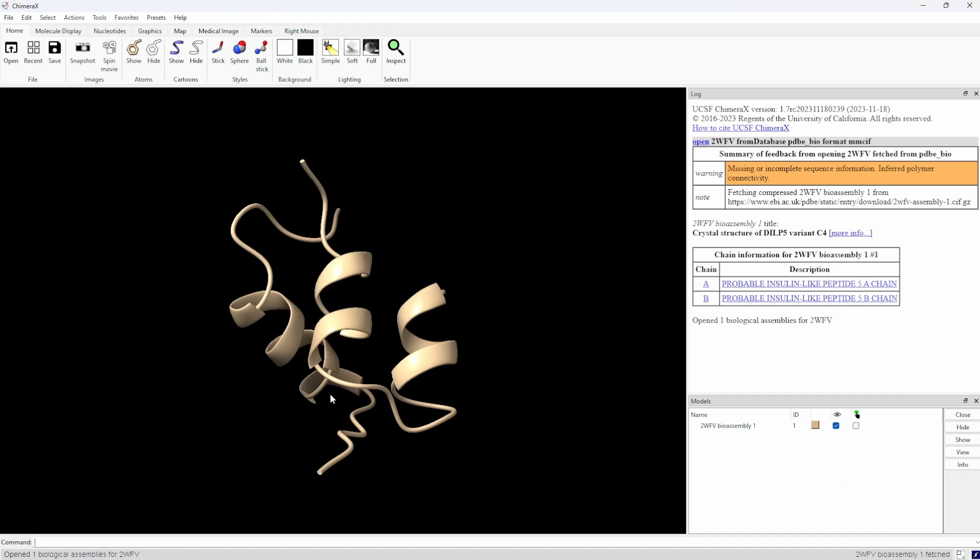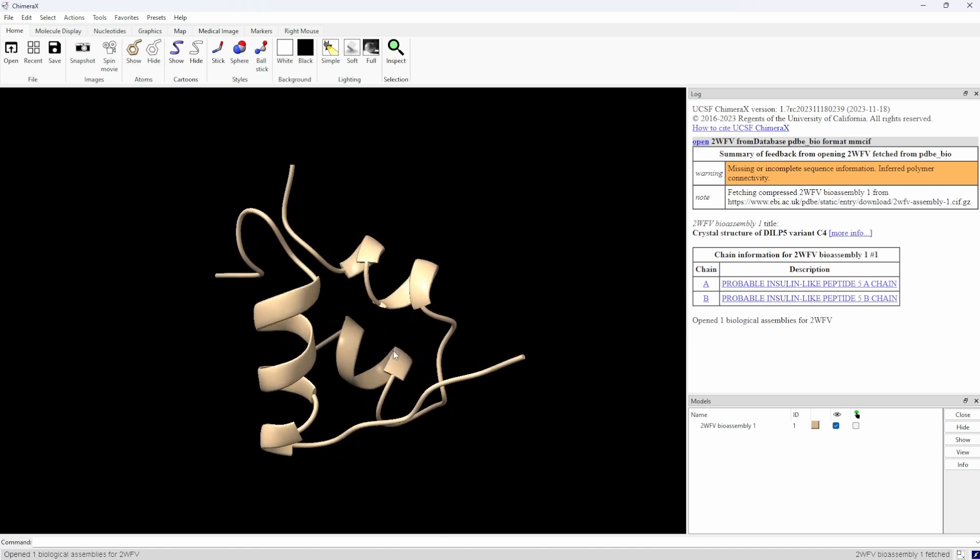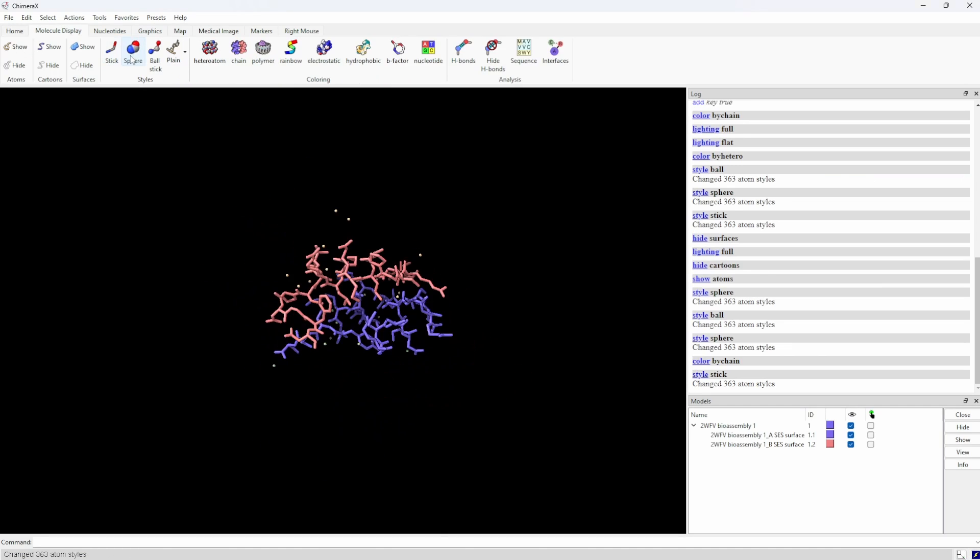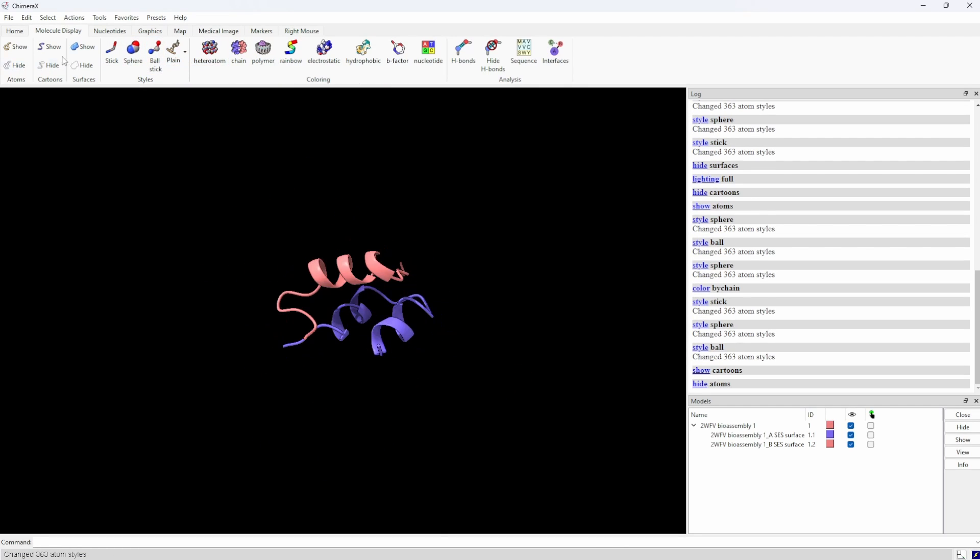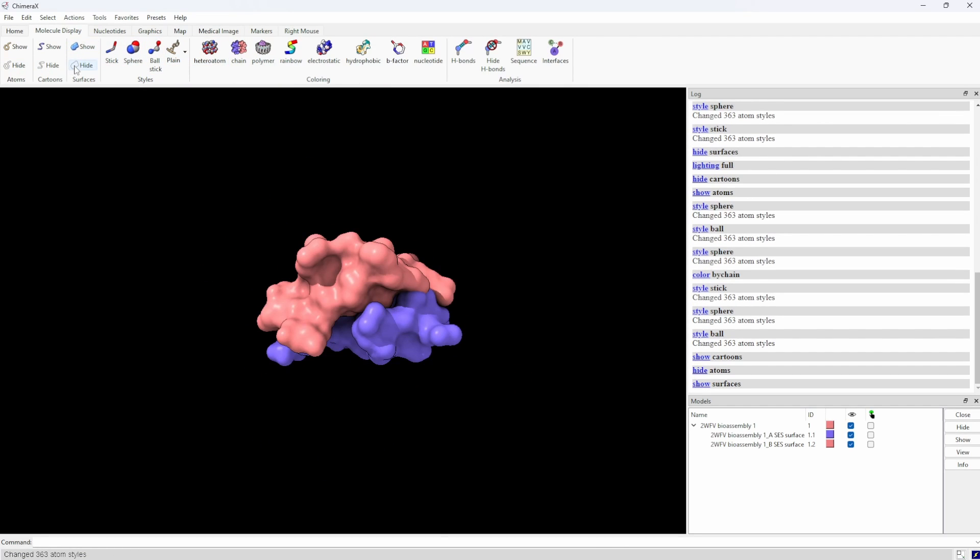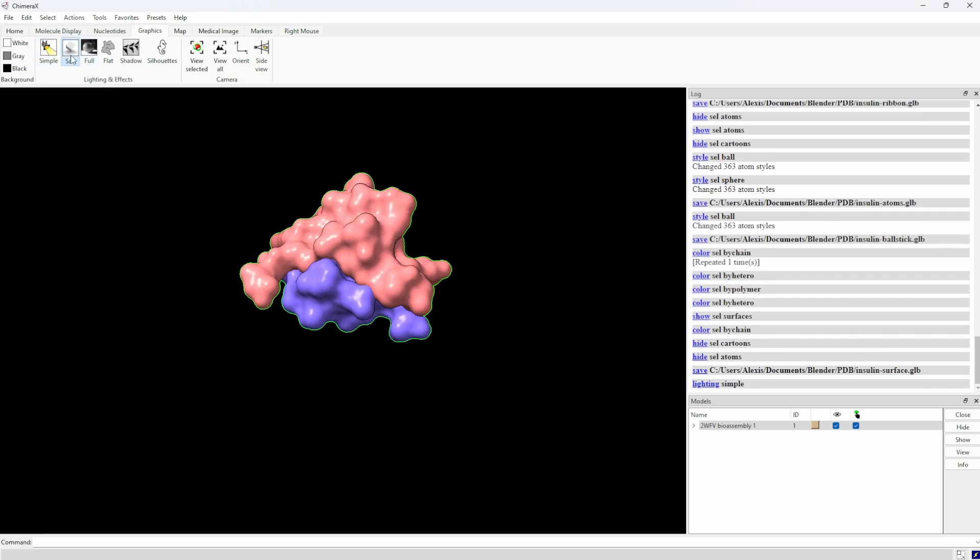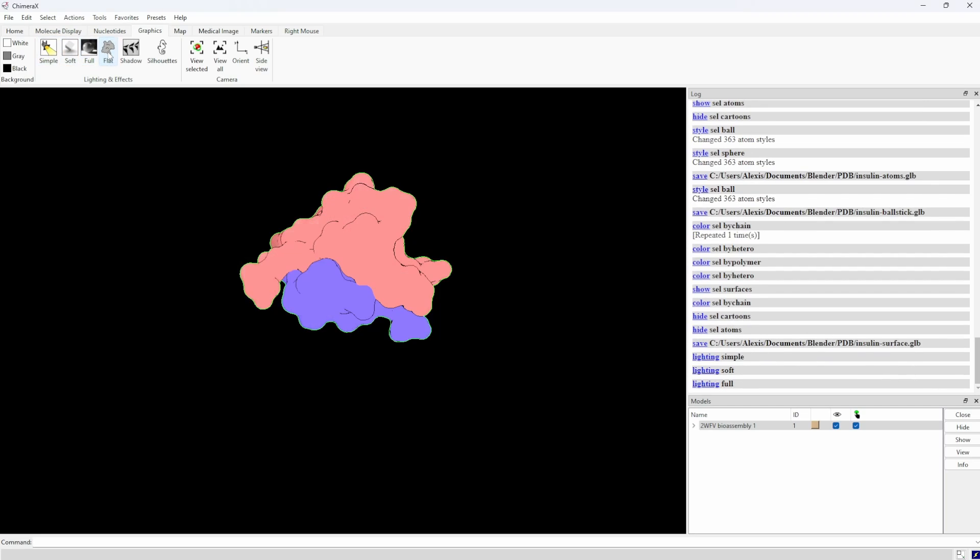With Chimera, you can do lots of things already. Visualize the protein structure by atoms, chains or surface, change the graphics. It looks nice.